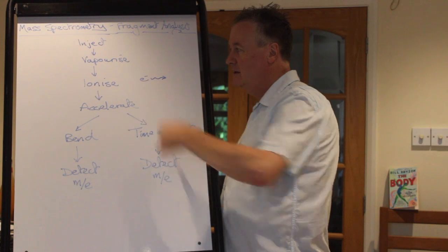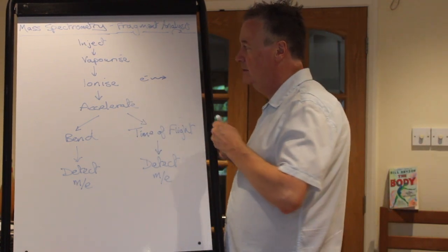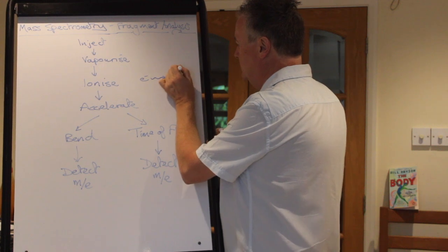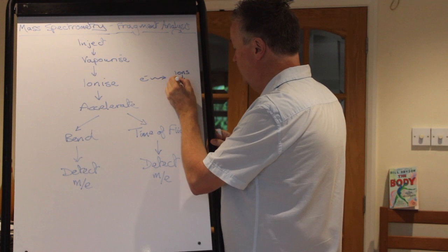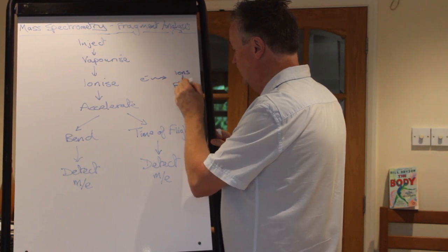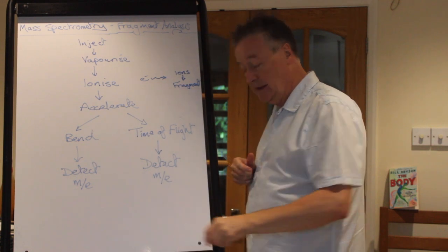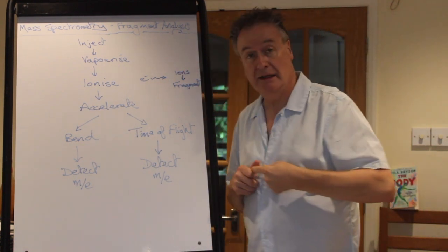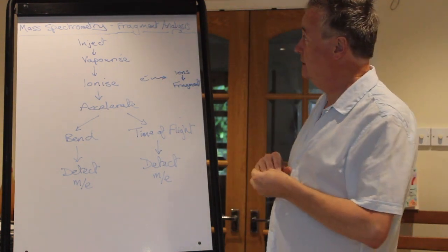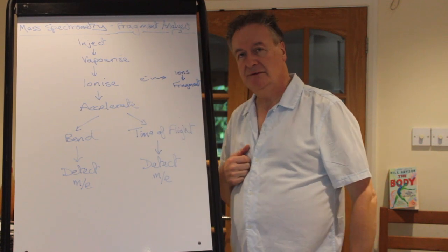Now during the ionisation, that's when the fragmentation happens. Like I said earlier in this video, it turns it into an ion and then it fragments. So that's the ionisation. Obviously that's critical to what we're doing today. They then get accelerated through the mass spectrometer.